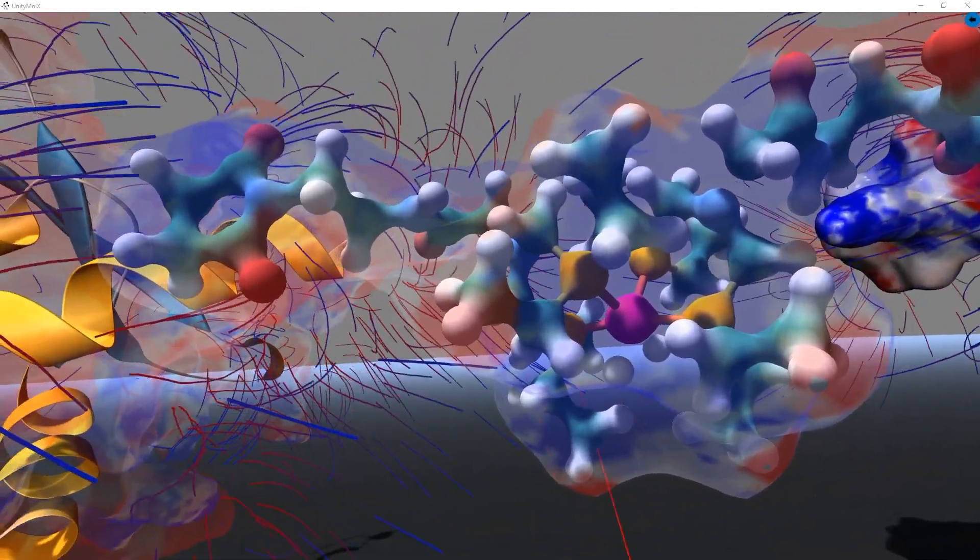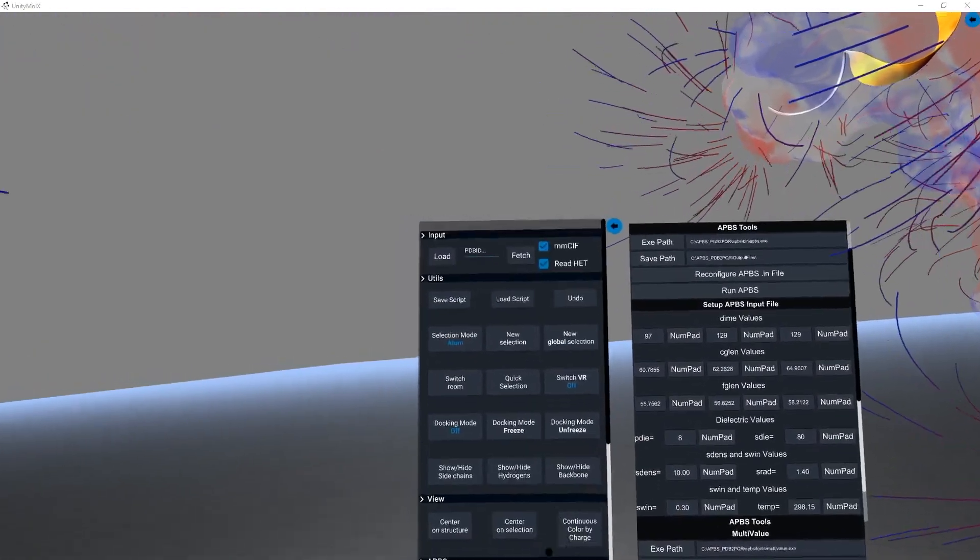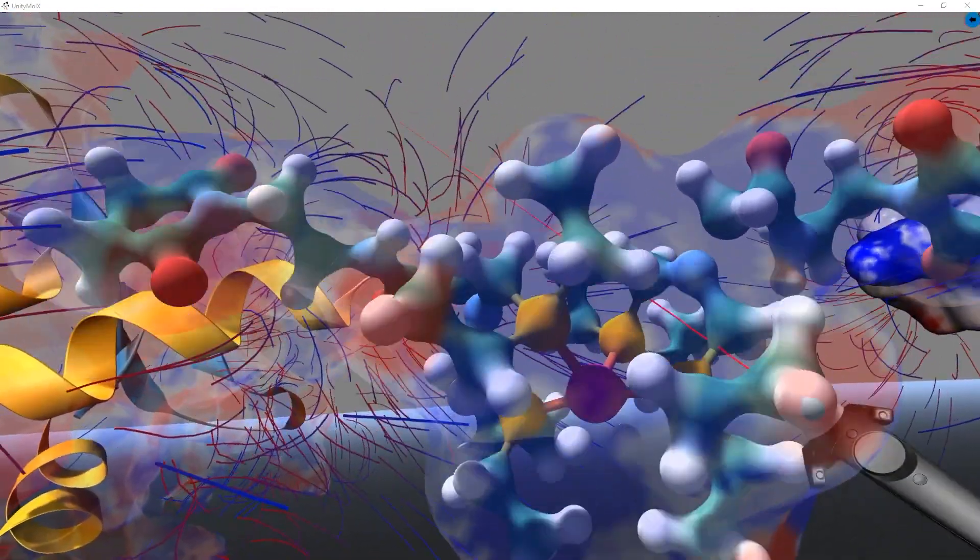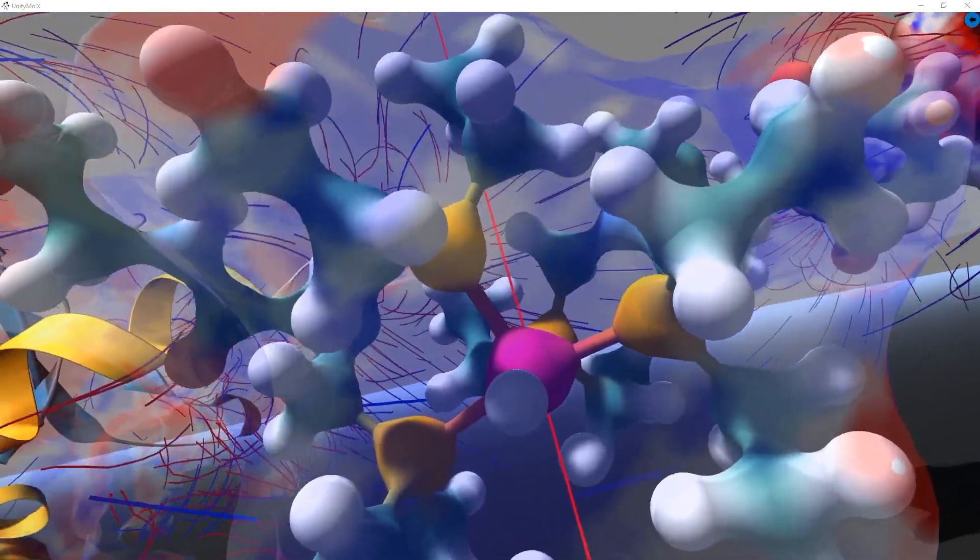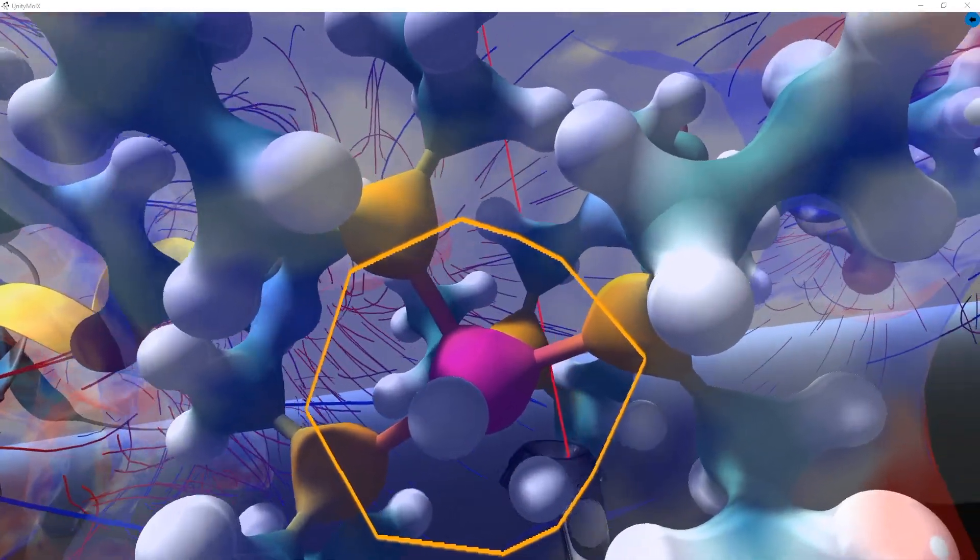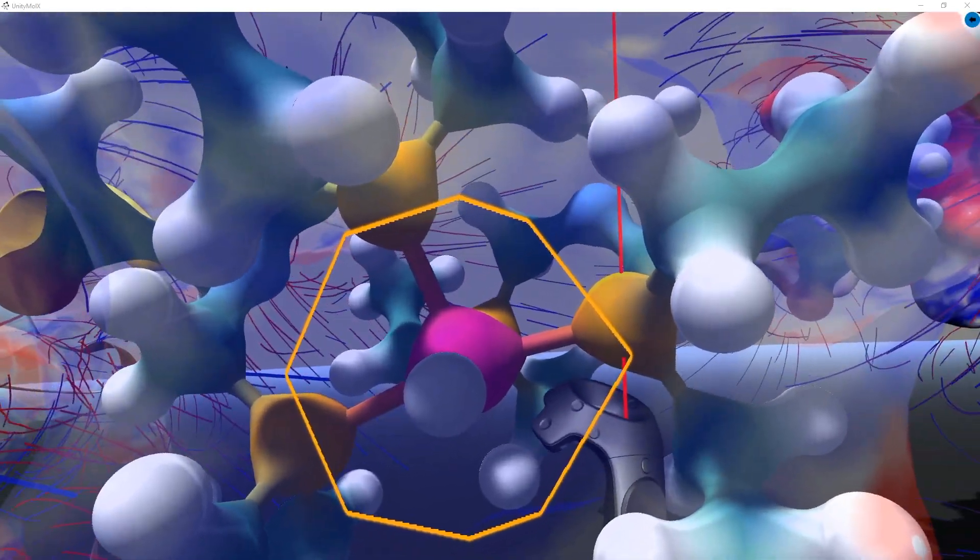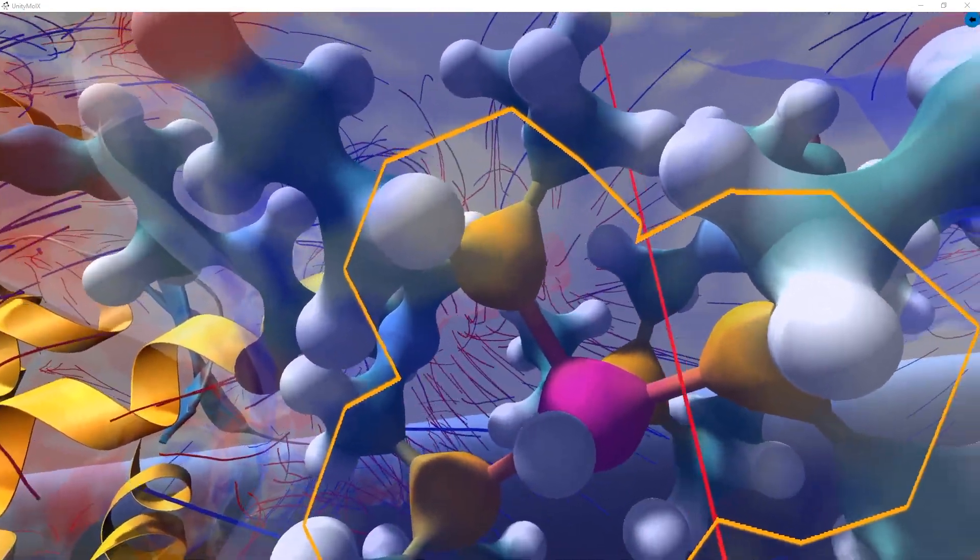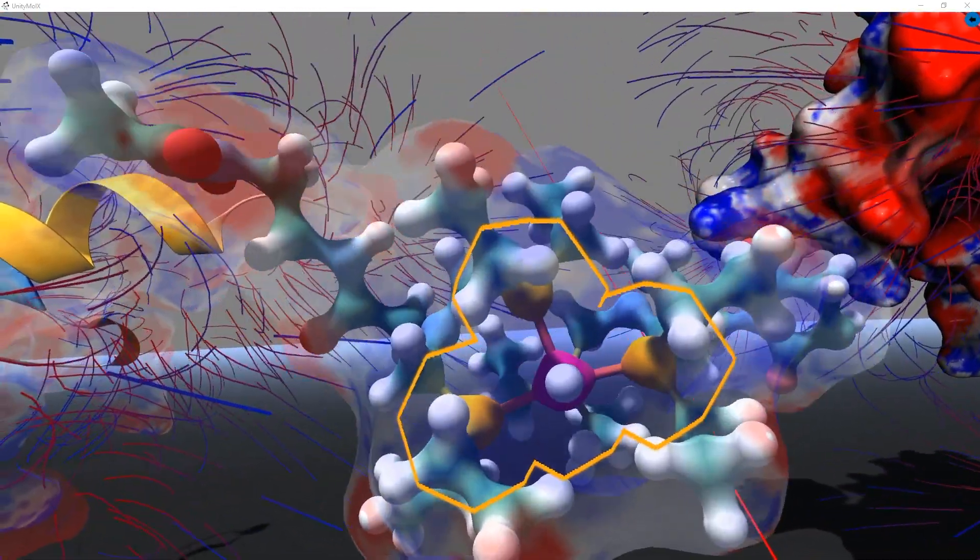Followed by literally just reaching out and grabbing the atoms to send them to our new selection. And here we will select the rhodium atom and the four phosphorus atoms. We can easily see which atoms are selected via this yellow halo.